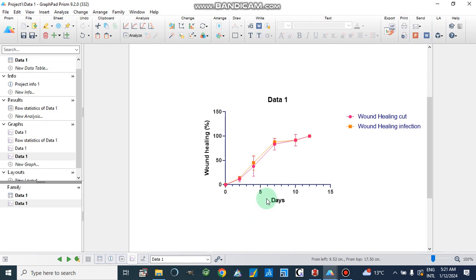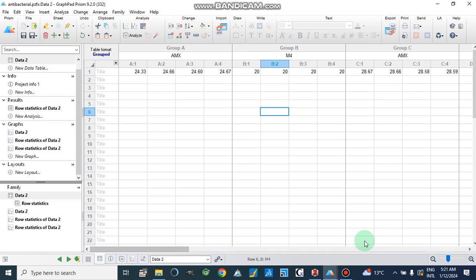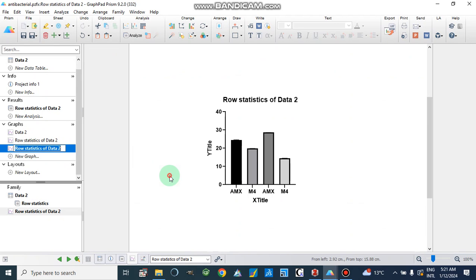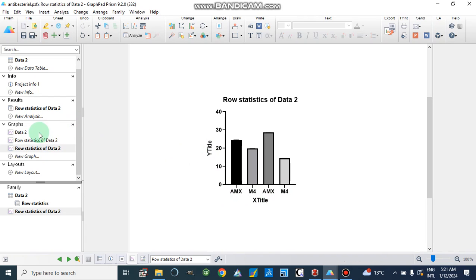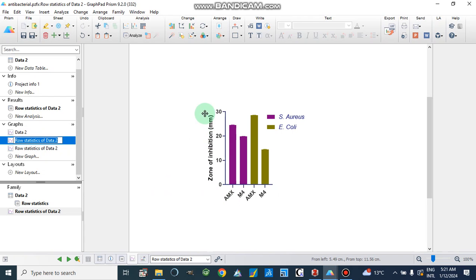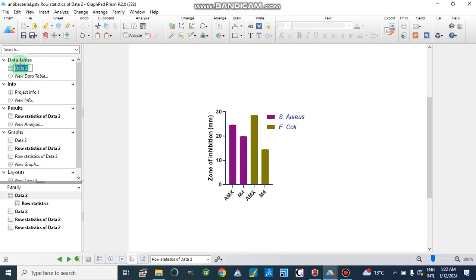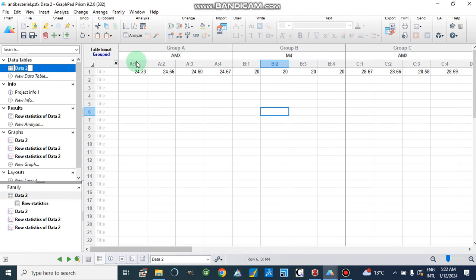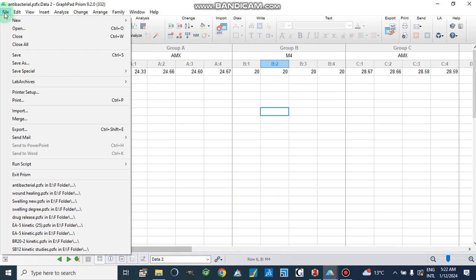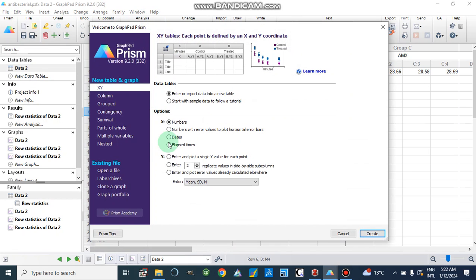Now I will show you another scenario where we have no values on the X axis — only different groups. For example, zone of inhibition for S. aureus and E. coli. For that kind of data, we will make a grouped data table. We will go to new project file and select group data, not XY columns.